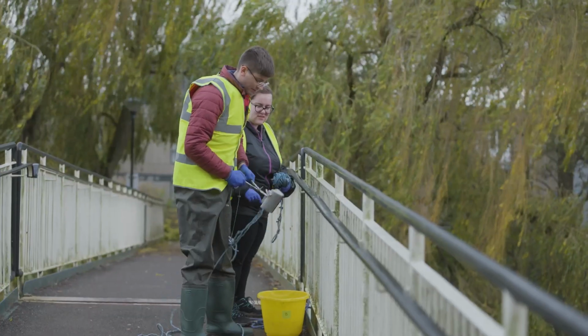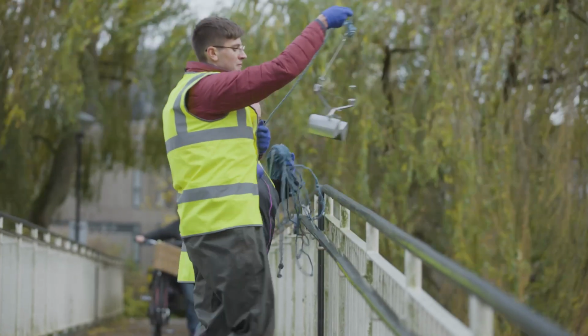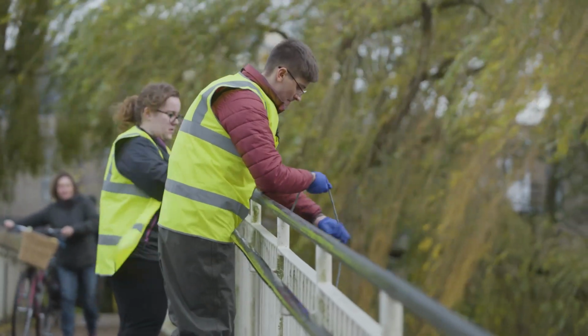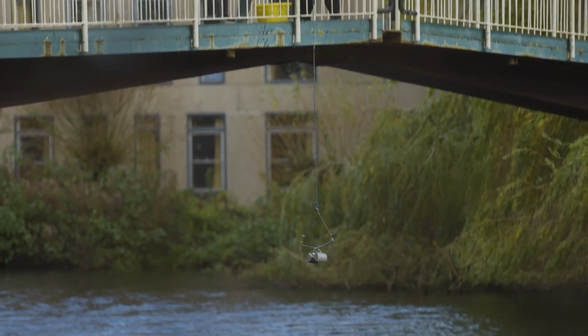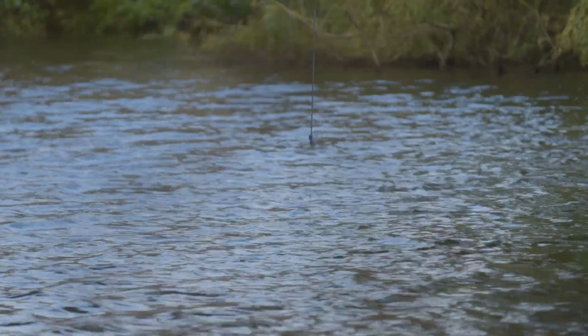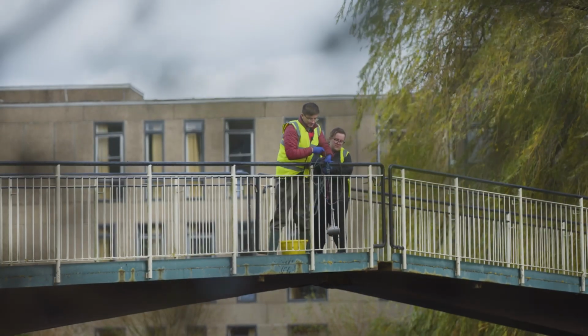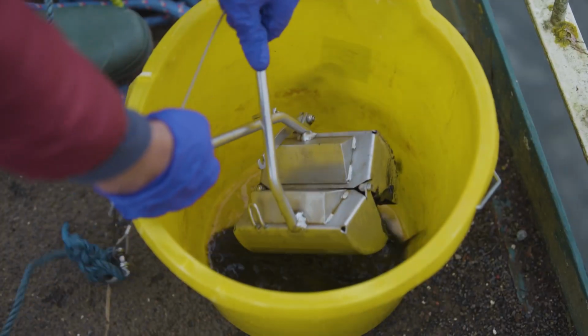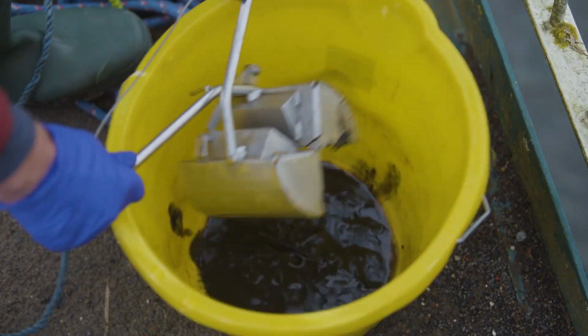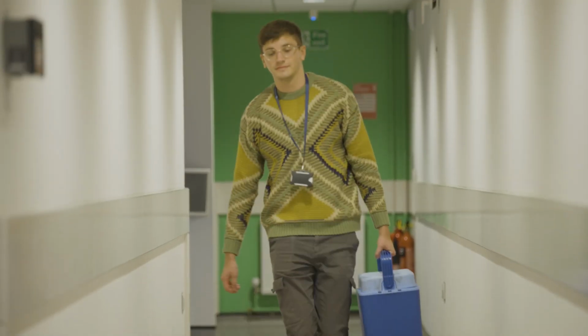A grab sediment sampler can be used for larger or deeper water bodies where access is via boat or bridge. A corer allows you to sample and analyze sediments at different depths and can be useful in constructing a history of chemical contamination at a site. After collecting samples, always clean the equipment using deionized water, then dry it off. Now you have your samples, you can return them to the lab for analysis.